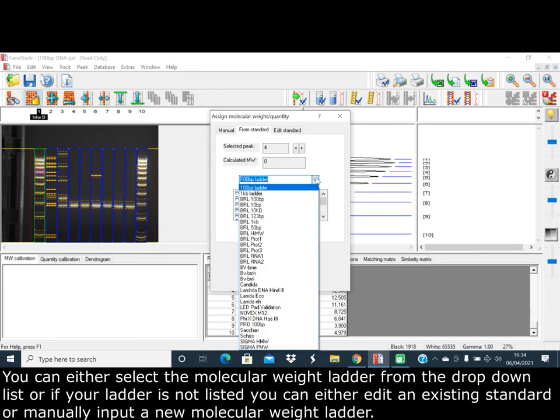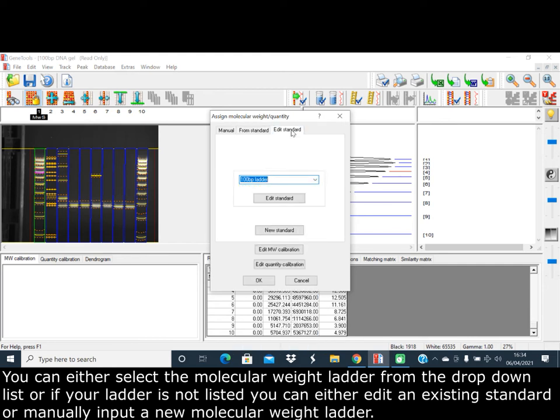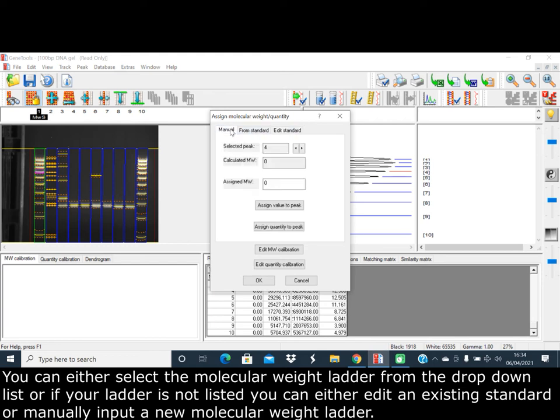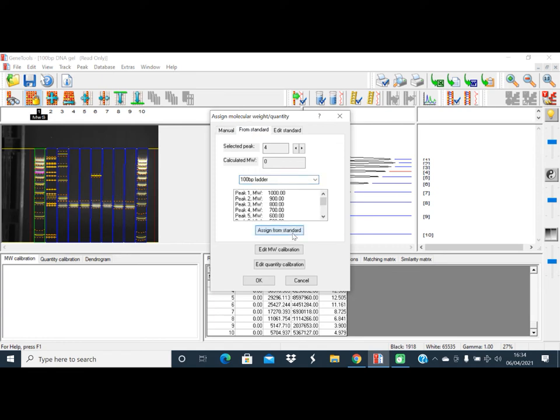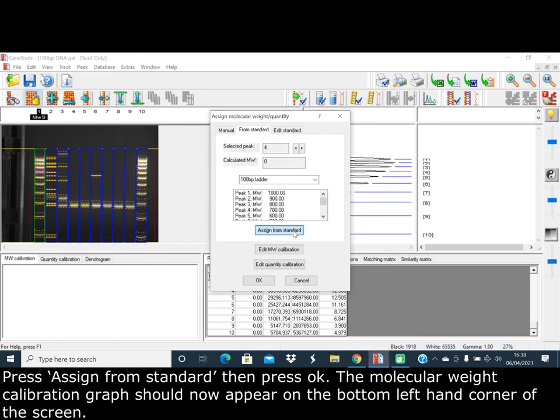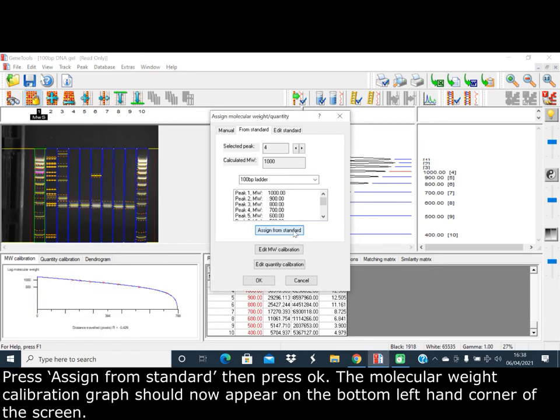Or if your ladder is not listed, you can either edit an existing standard or manually input a new molecular weight ladder. Press Assign from Standard, then press OK.